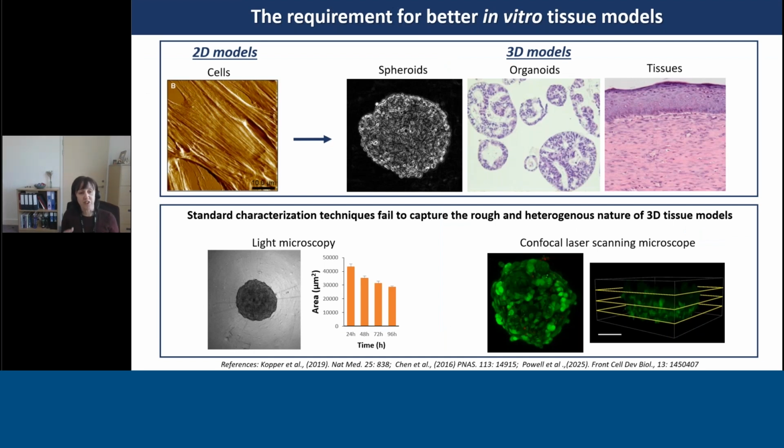Research is transitioning away from just using 2D models for therapeutic agent design and drug testing, and is transitioning to using 3D models because they are more clinically relevant.